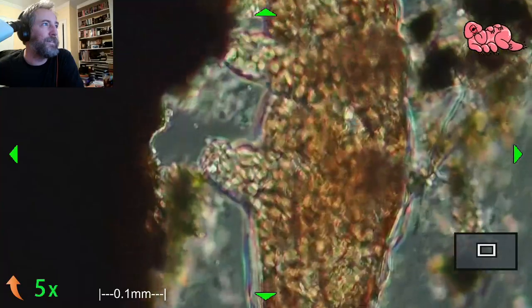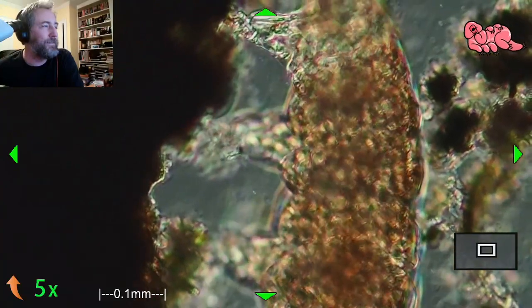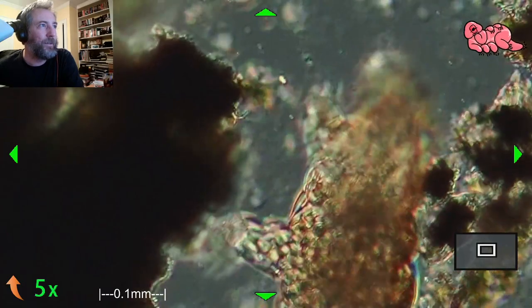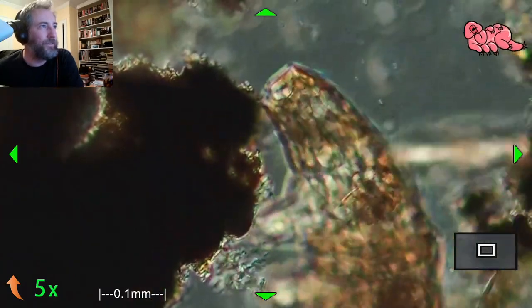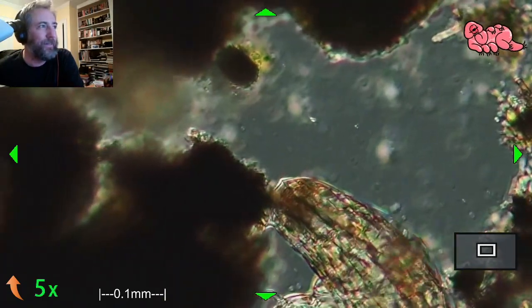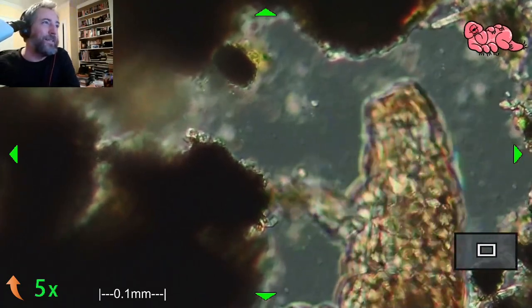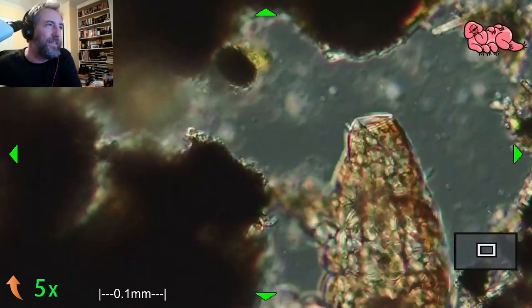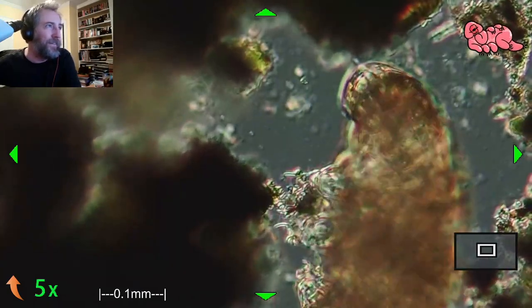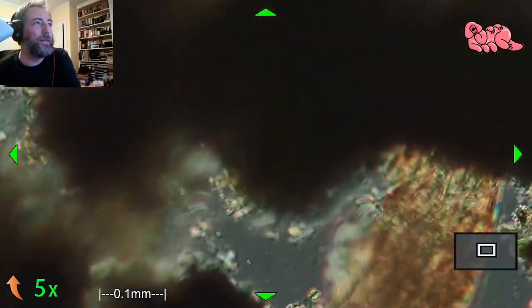And then the front legs, they have six of those. And they work independently to sort of clamber around or grasp things. And then typical water bear heads are just, that was a rotifer flying through there, barely differentiated from their body. So it's just like a sleeping bag, right? That comes up. All one piece. And then this one's got a bunch of little sort of whiskery eye stalks. And then those usually surround a little mouth. That's like a vacuum cleaner, basically.